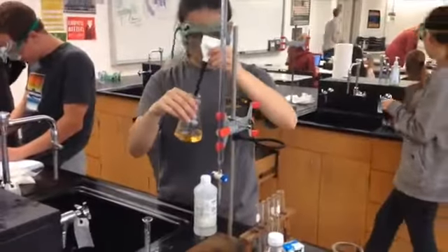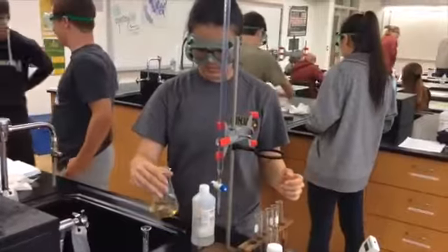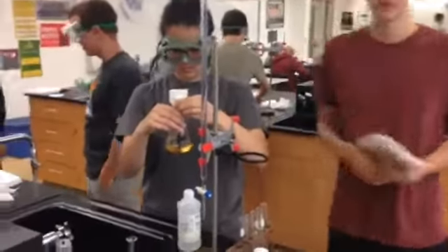Continue titrating in 1 ml increments and recording the pH after every addition until you're nearing the equivalence point. This could take a while, depending on which juice you use.